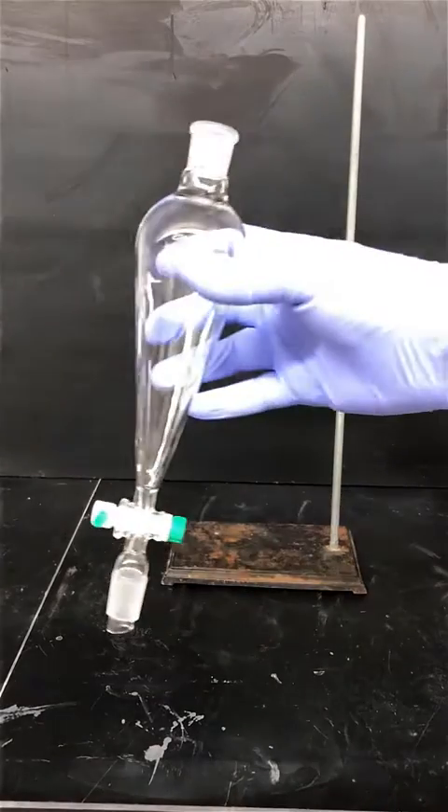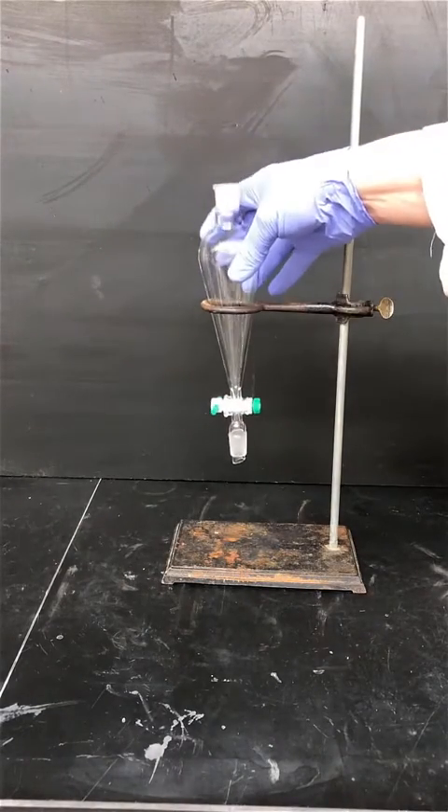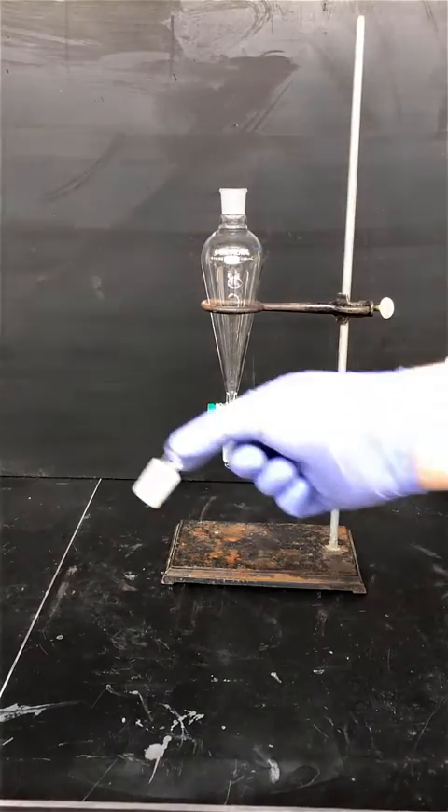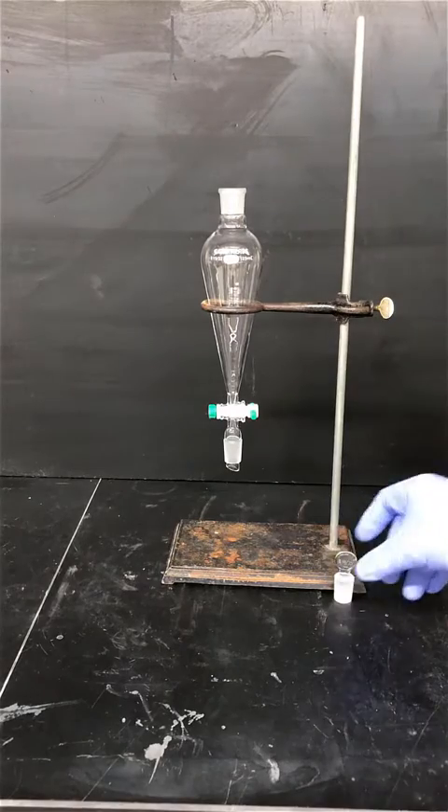Get a ring stand and a ring that's appropriately sized for your separatory funnel. Clamp the ring on the ring stand and then take your separatory funnel and make sure it fits — it should rest comfortably in the ring. You should have a stopper that goes on top of the separatory funnel; make sure you locate that.